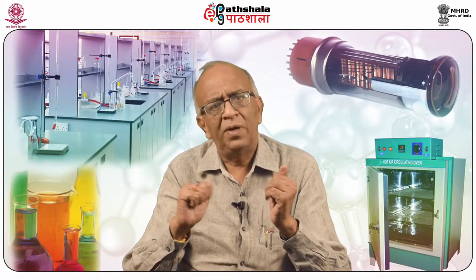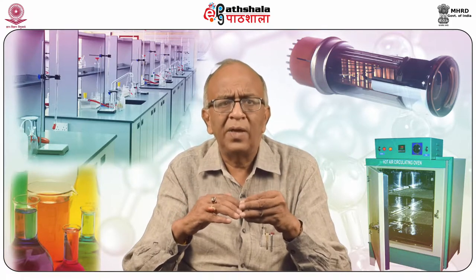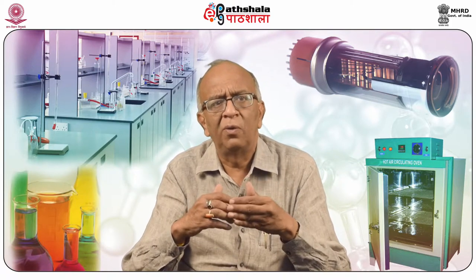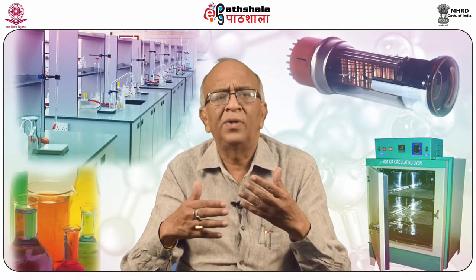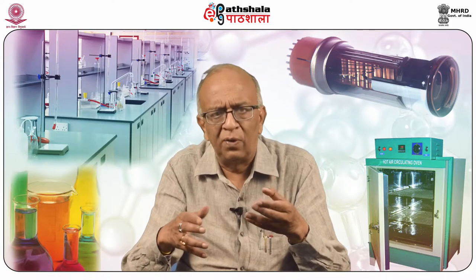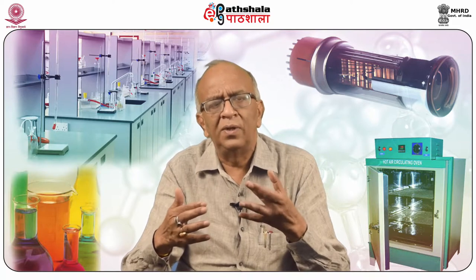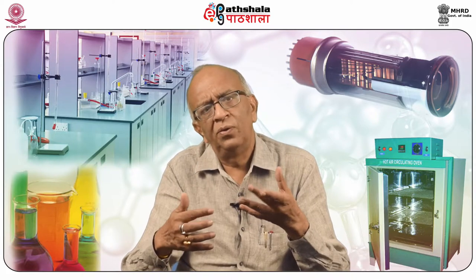So in the first, I shall tell you when electromagnetic radiations strike the substance, passes through a solution, a certain portion of it is absorbed, and its intensity is decreased. So by the measurement of that decrease in intensity, we measure the concentration of the unknown substance, or we can say the decrease in intensity is directly proportional to the concentration of the unknown substance.